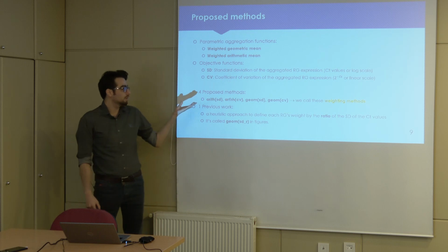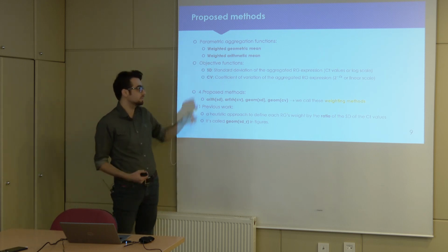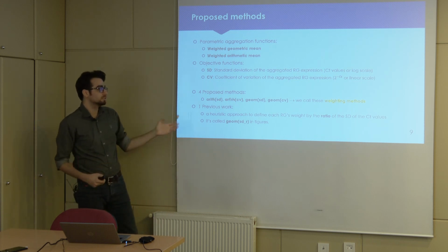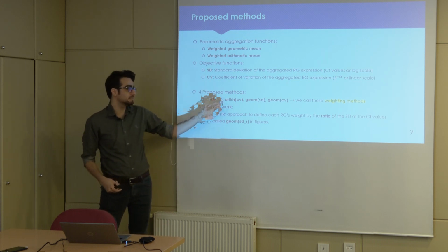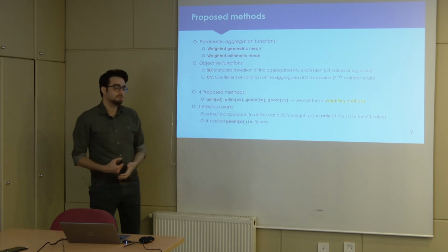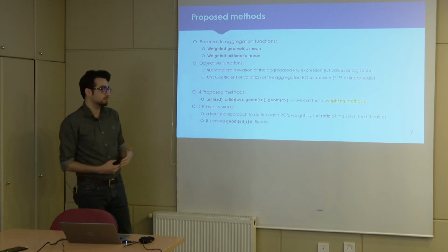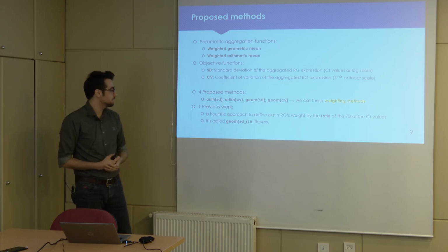Now we can propose 4 different methods from these 2 combinations. We call them arith-SD, arith-CV, geom-SD, and geom-CV, where arith is arithmetic and geom is geometric. We call these weighting methods. So when I say weighting method in the presentation, I'm referring to these methods.